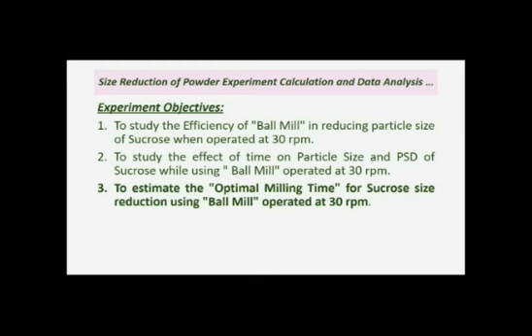To estimate median particle size at each sampling time, particle size analysis is required for each sample. How? We can do so by building up Microsoft Excel tables. Here is a table that shows the results you gained during the experiment. Now, to do particle size analysis for each sample, we have to build up the following tables.